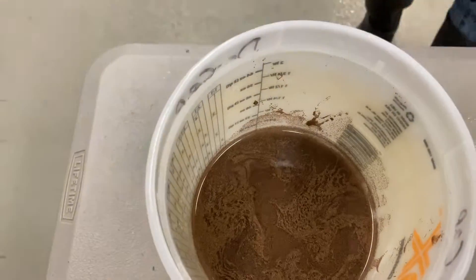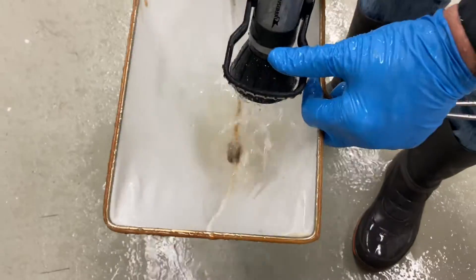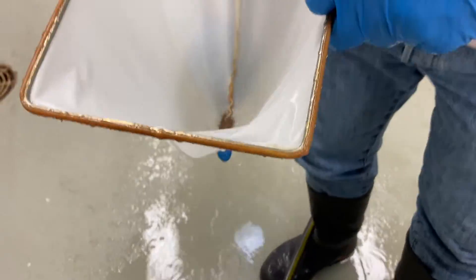Here we're releasing the cysts into the bleach and water solution. Focusing on the cysts in the bucket, this process takes three minutes.